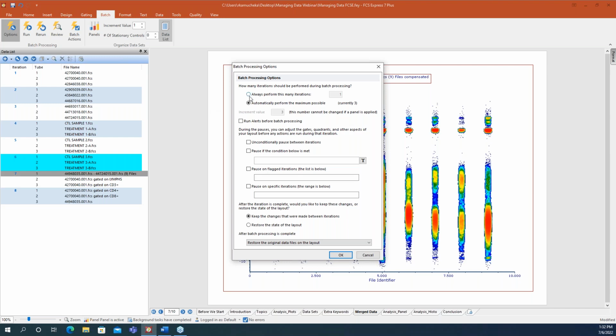But also, if I'm working with a lot of controls, I have some additional flexibility where I'm like, okay, I know the first 3 iterations, maybe those are all controls. So I only want you to run 4 through 8. That's going to give me 5 iterations, and I can go back and adjust where I am. So anytime that I need to go back to a different iteration, I can click to that so that I can make sure that I get to those maximums.